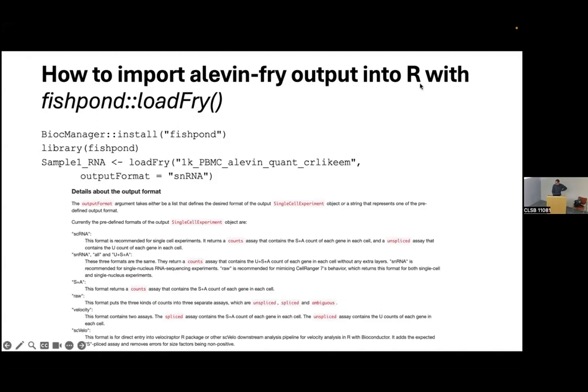Because in 2 weeks or so, data science will be hosting a follow-up to this workshop, which is more advanced single-cell RNA-seq analysis, integration, clustering. What I'm going to say in the last 5 minutes today is really just a very, very broad overview of how we dovetail coming out of AlevinFry into the typical Seurat workflow. And I'm going to move pretty fast just to give you a general overview of what that looks like. But the more detailed, proper QC, clustering, integration, all that stuff is going to follow in the next workshop.